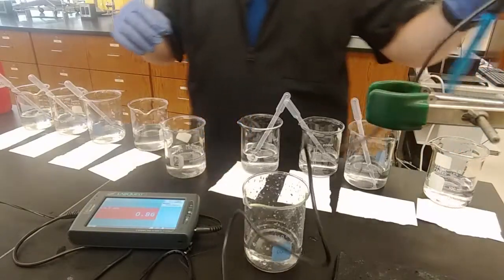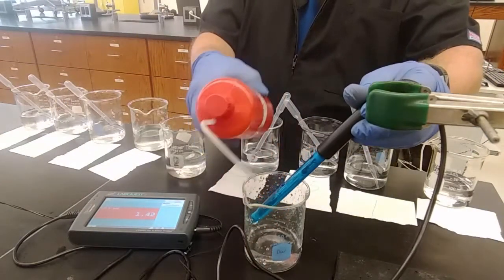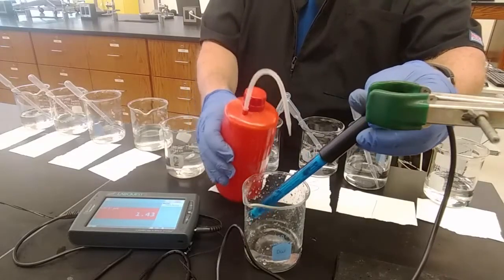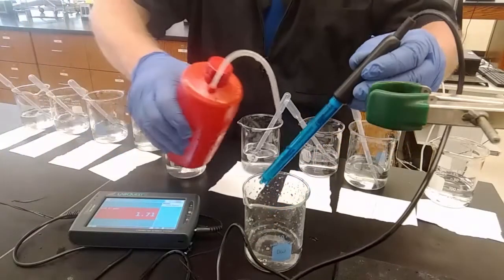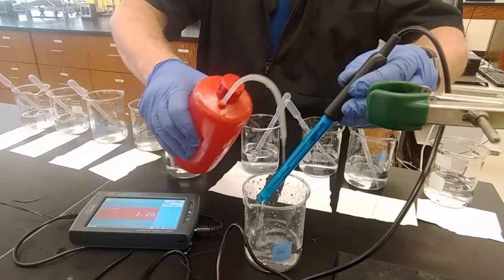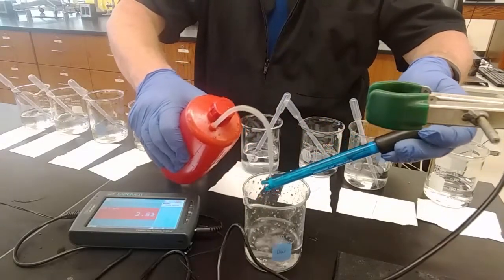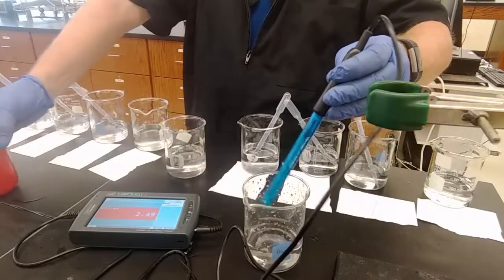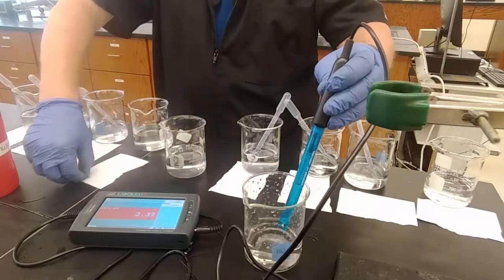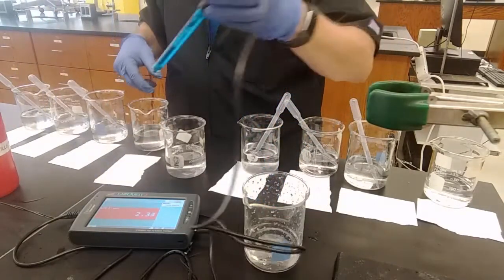Definitely low pH. We may not be able to trust this to the 100th place, maybe not even to the 10th place, but we can definitely determine if it is an acid or a base. Let's go to the base side of things and see what we get. And the rinse that I'm doing here of deionized water, based on our test of the water, not so deionized. All right, we're expecting pH 10 based on our dilution.